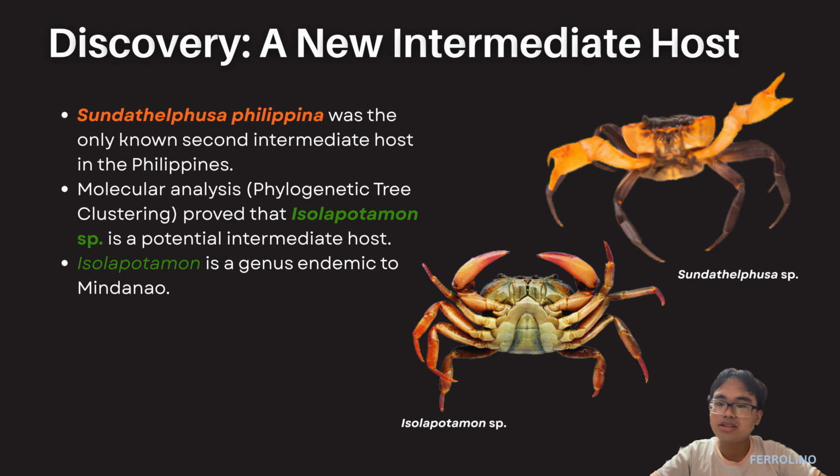Specifically, the sequences showed a 99% similarity to the Isolapotamon sp. reference, referring to the accession number MT514316.1 as an example. Isolapotamon is a genus endemic to the Mindanao region.